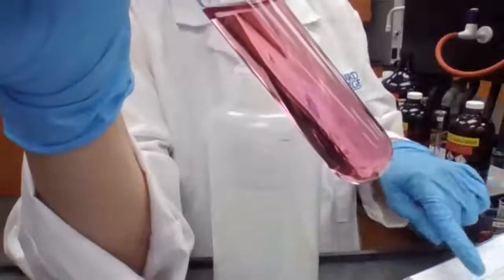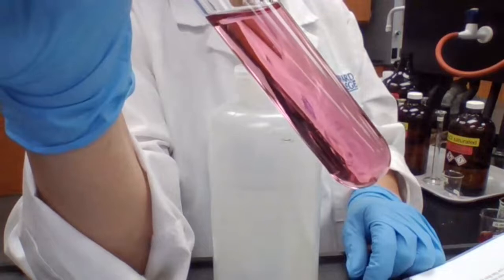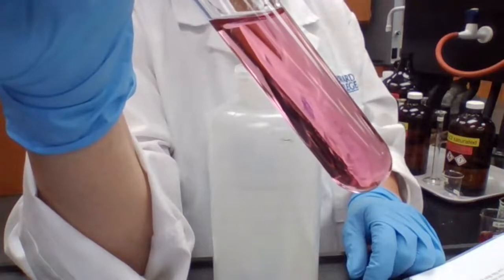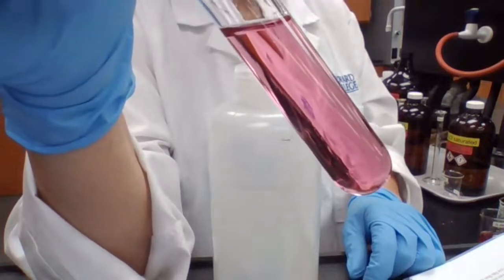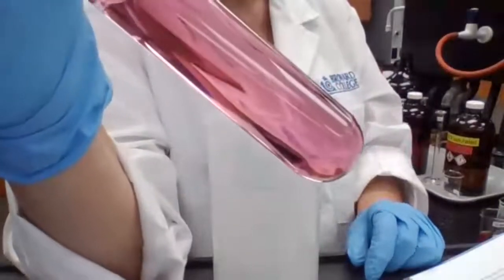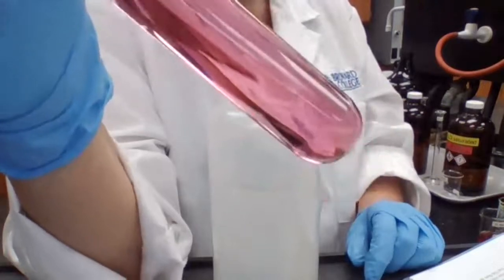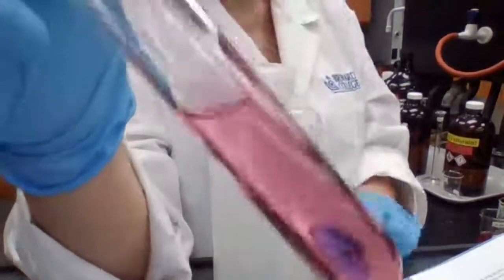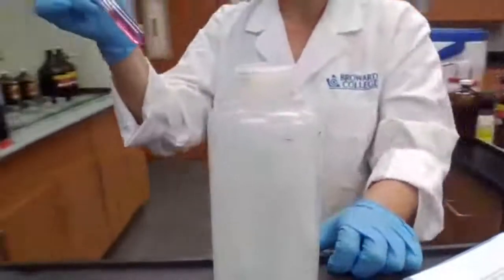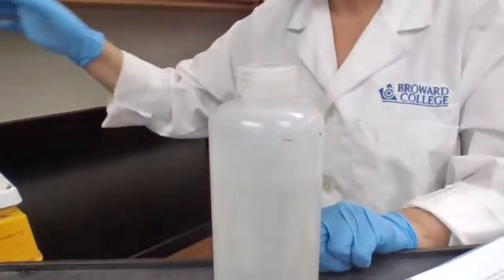Adding to test tube 1, we added water, until no more color change. We saw that everything has changed back to the original pink color that we had. It went back from blue. So we are going to place this solution now inside the hot water bath.